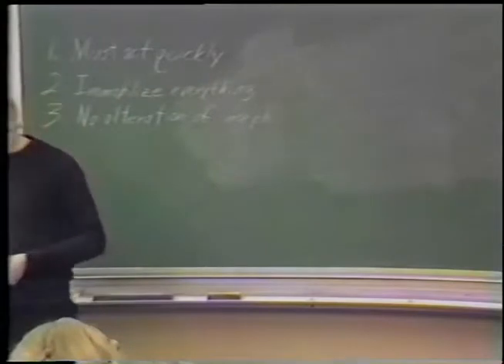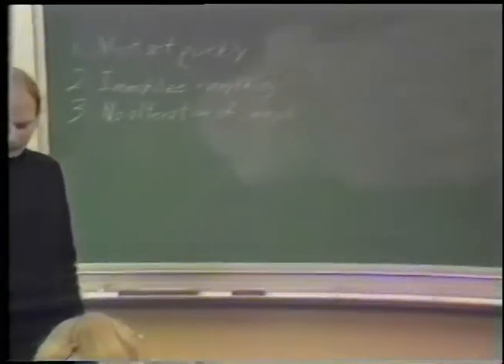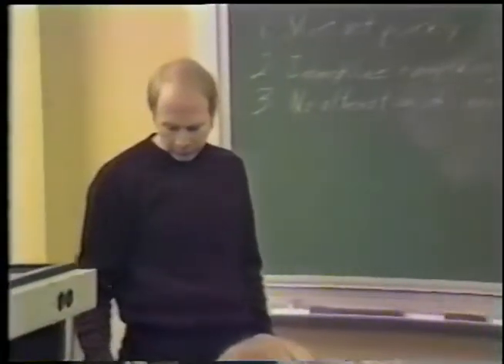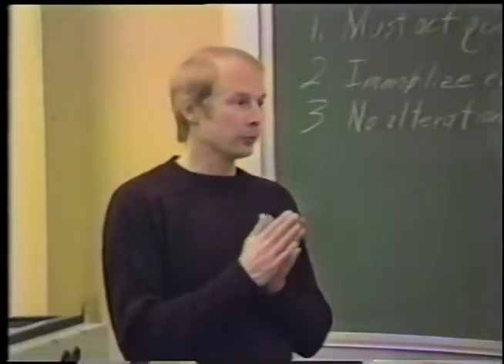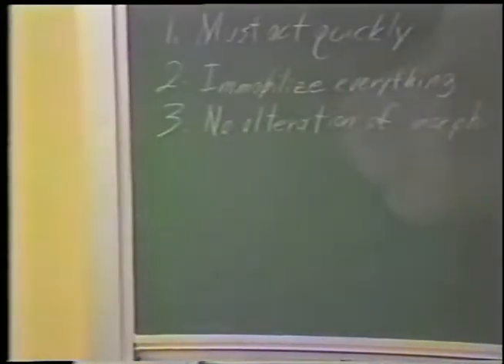Okay, so much for the artifacts of chemical fixation and cryoprotection. I'm now going to talk about what ultrarapid freezing is, the physics of ice crystal formation in biological systems.